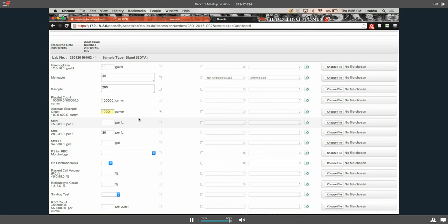Is that actually being done by all the filters that are applied to a range? Like it says 100 to 600, but is that based on the age and gender of the patient? Vinay, I'm not too sure about this. Can you answer this question? Is this range based on the age and gender of the person? That one ideally should be. I'll have to go back and check the code to see if that really is true.